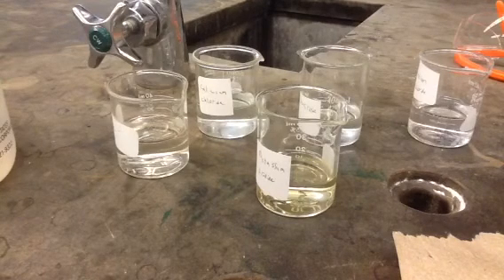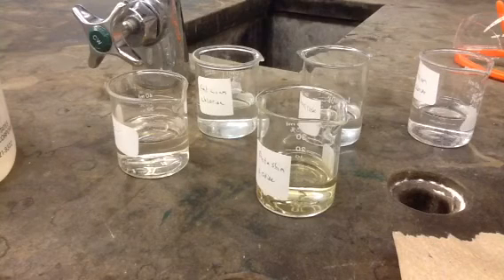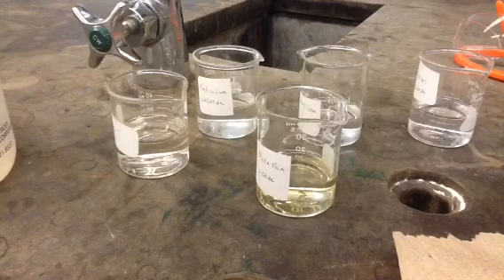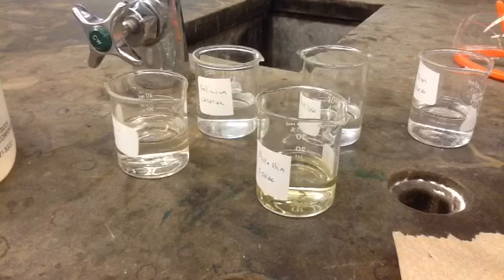Solubility in water. Solubility in ethanol. And our last property was conductivity. So you need to consider all 4 of those, and you're just going to say, group 1, these 3. This is like which of these things is not like the other. For each of these, you're looking at relationships. You're not going to say anything about them, just group 1, group 2.